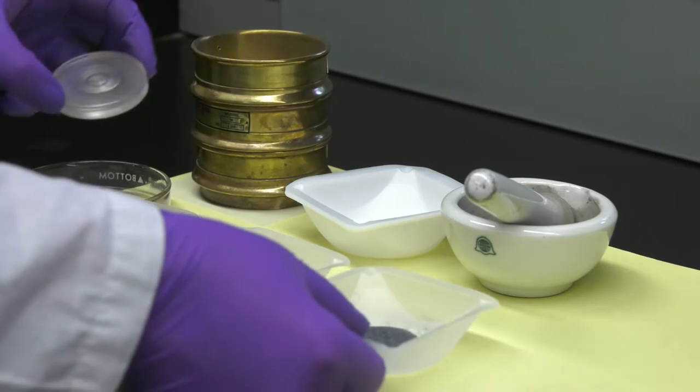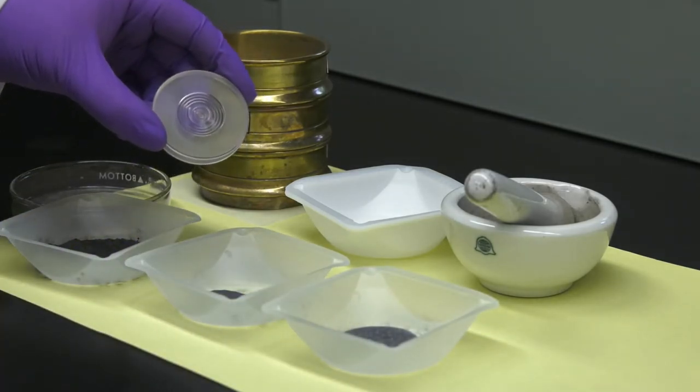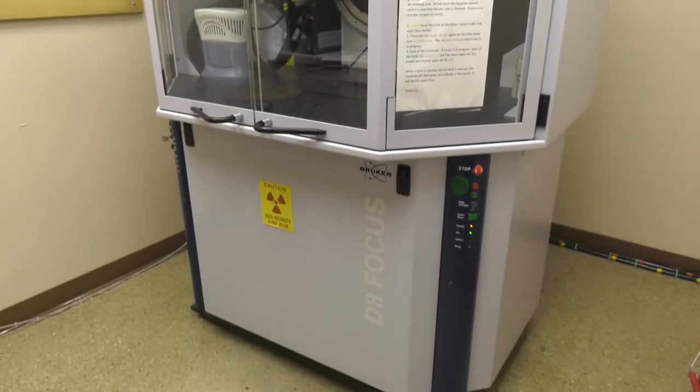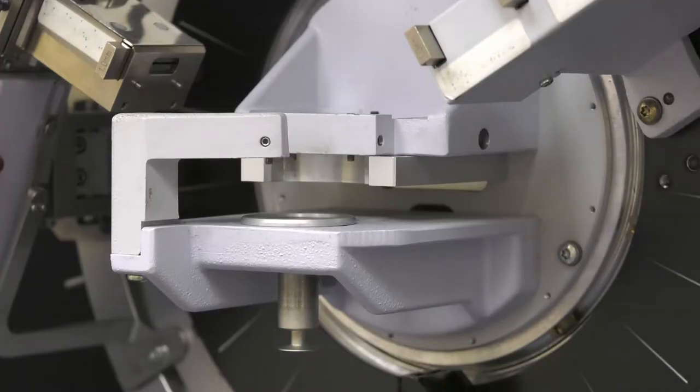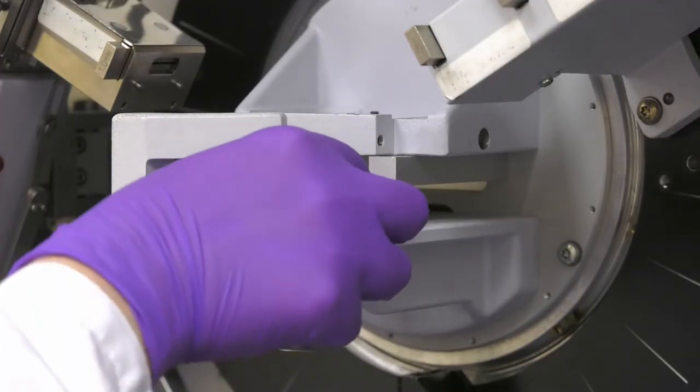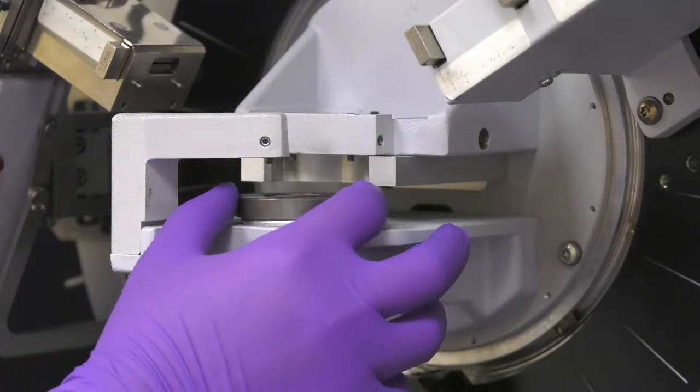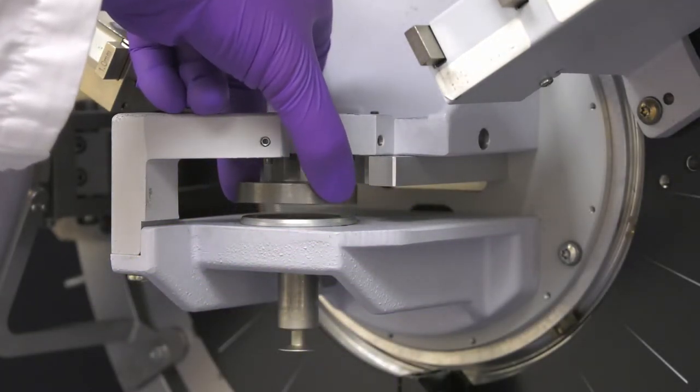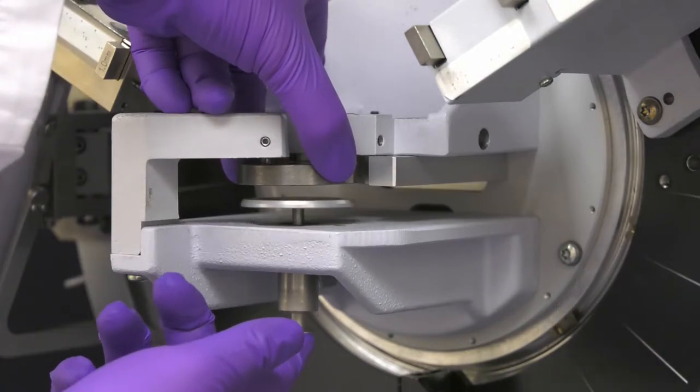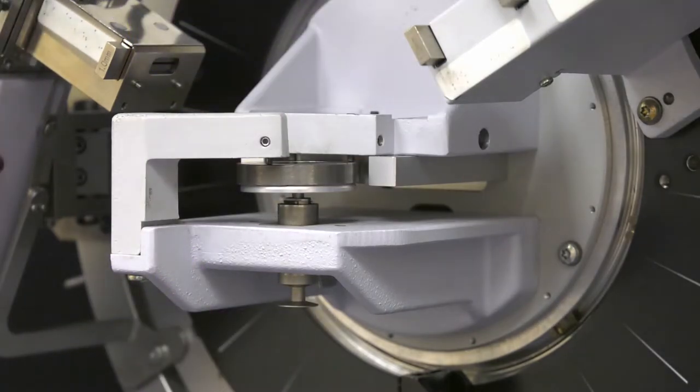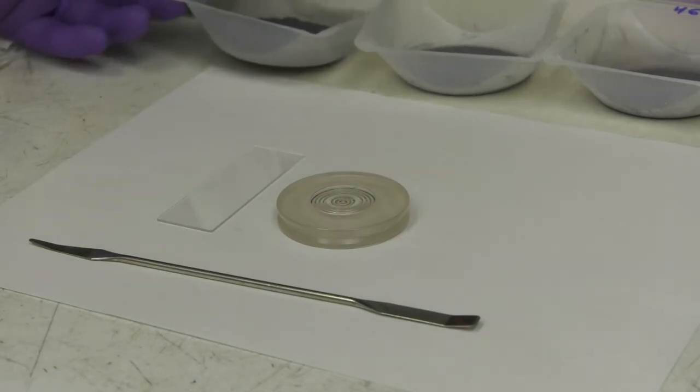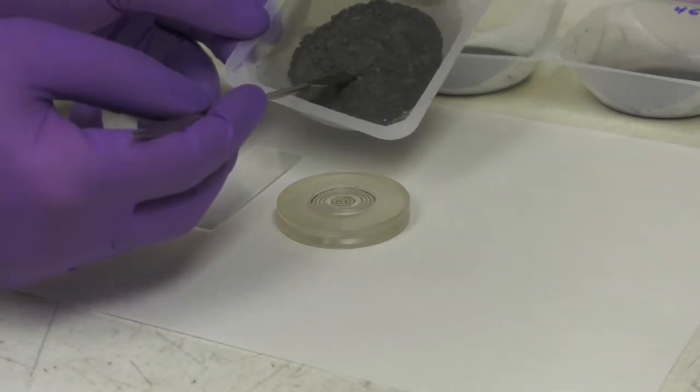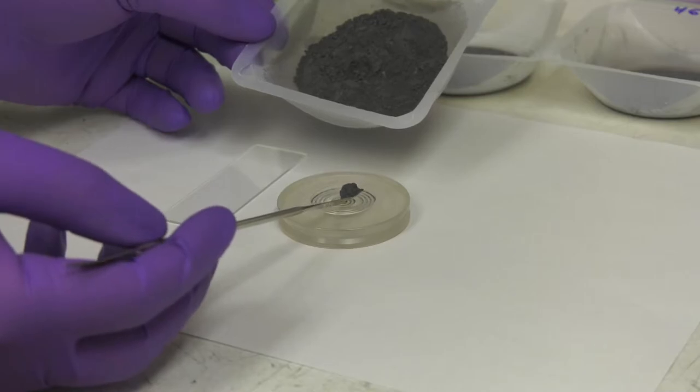These samples will be put into the sample holder for XRD. First, the single crystal sample is measured using XRD. Once the powder sample is measured, a powder sample is prepared in its holder. Powder is carefully placed in the middle of the sample holder and spread around.